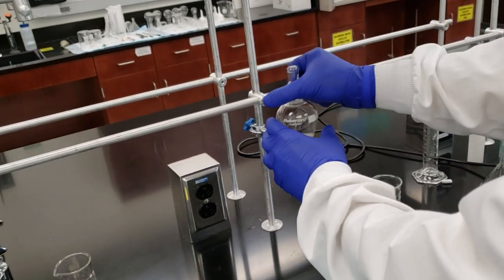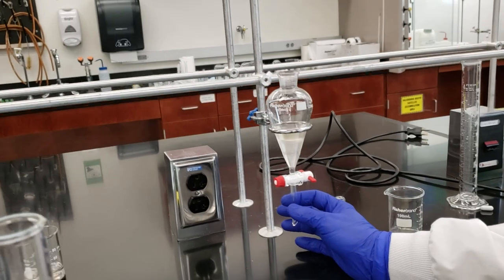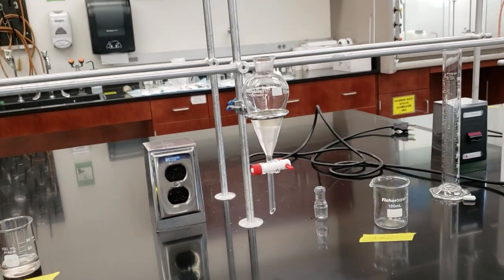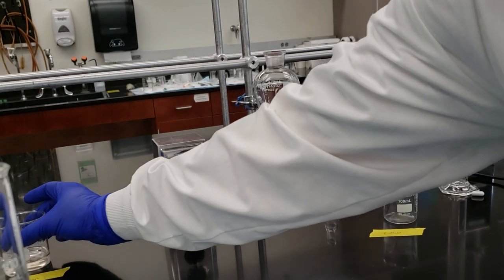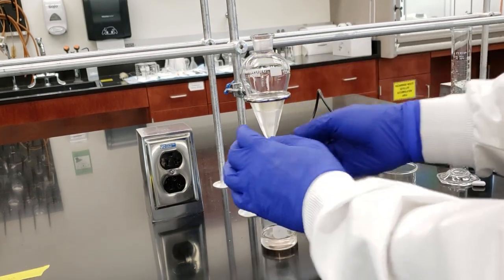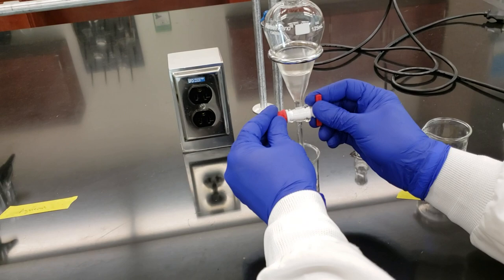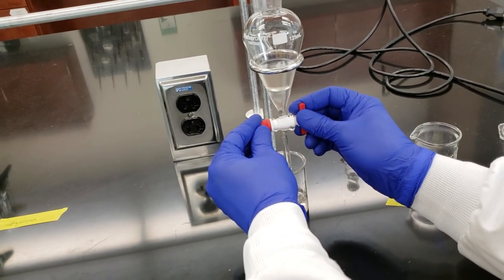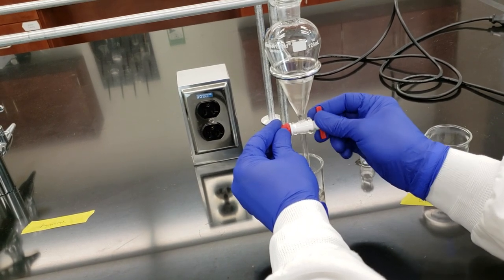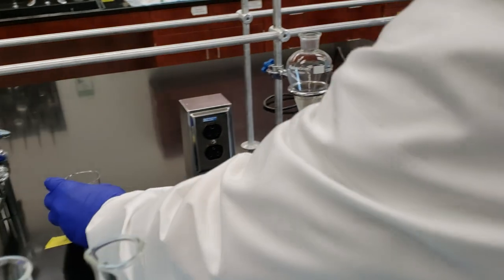And then back into our ring clamp for separation. Take our stopper out. Our separation is almost immediate at this point. Now, our bottom layer is our aqueous layer. So I'm going to go ahead and take our aqueous beaker from before. We're going to drain out our aqueous layer. We'll set that aside again.